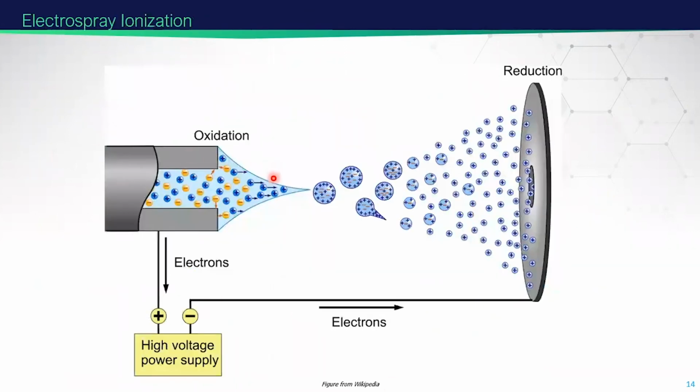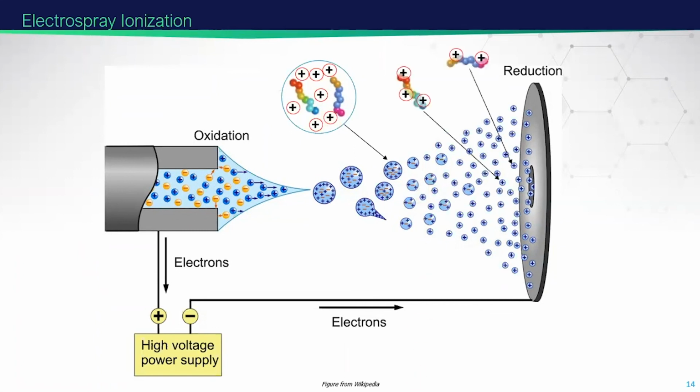And then you can send them through the electrospray. At the end of the elution, you apply high voltage, and they make lots of droplets containing multiple peptides, but the droplets get smaller. Eventually they will contain maybe just one peptide per droplet, and the water evaporates. In the end, you will only have peptide molecular ions, which are sent into the mass spec.